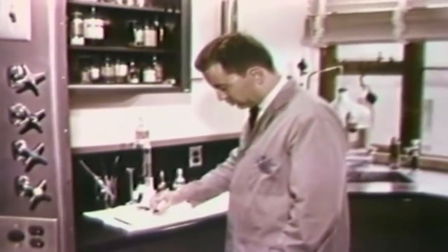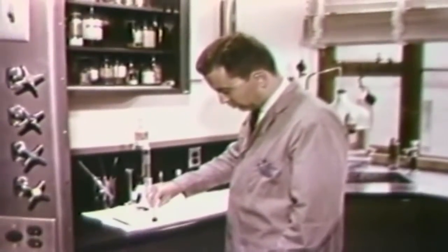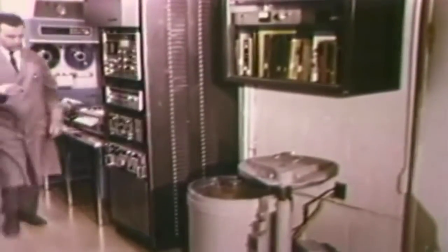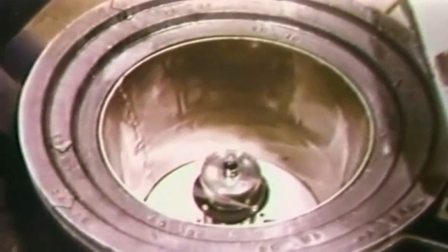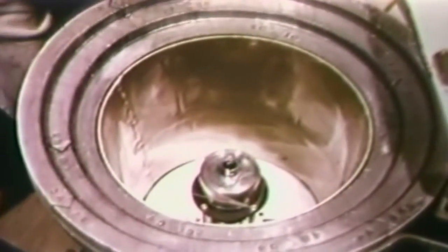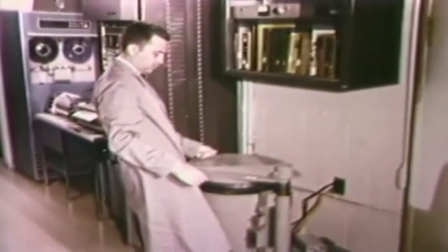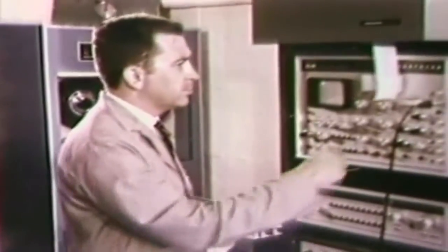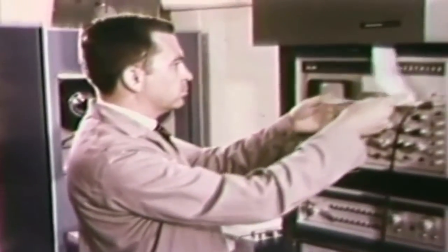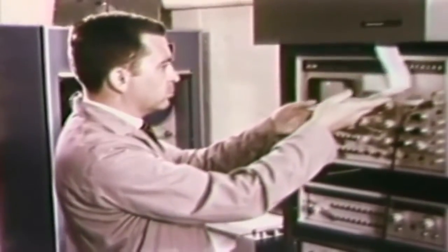This liquid is now poured into a glass container to be analyzed. The container is then placed in a lead-shielded radiation detector. Radiations characteristic of arsenic are sensed by the detector and can be read by the analyzer. Data accumulated by the analyzer is printed out in numerical form for use in calculating the amount of arsenic present.